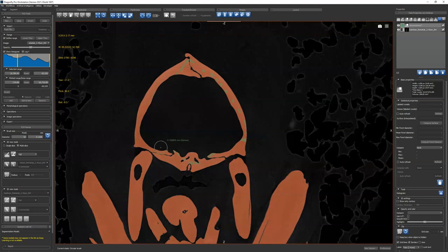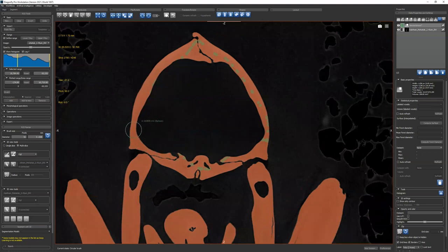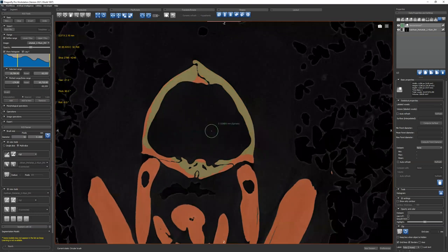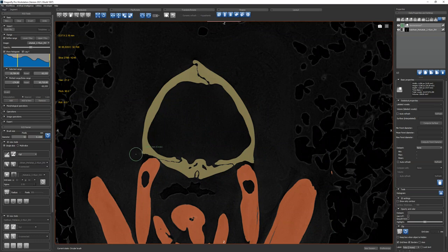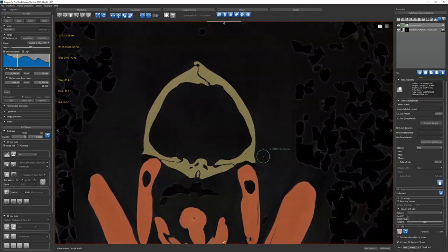So if you want to be more precise, you have to use a smaller brush, but it will paint fewer slices. So if your structure is changing fast, you would have to use a small brush. And then I would say you can do a lot with this: get the bulk of your structure done, and then take it off of multi-slice and go back and fix every little issue that you see. Sometimes it's easier to fix it if you were looking at it in 3D.